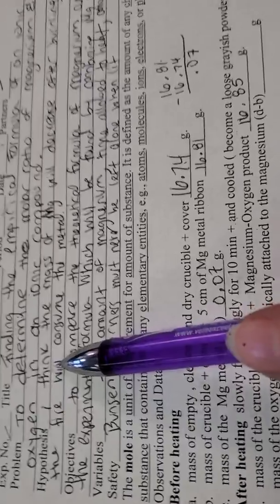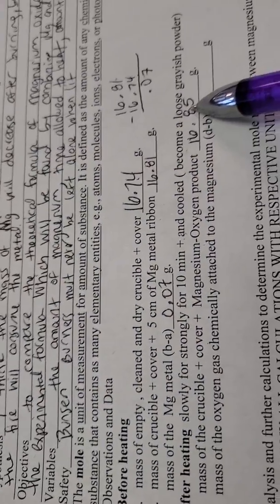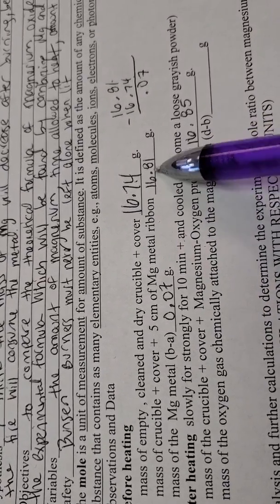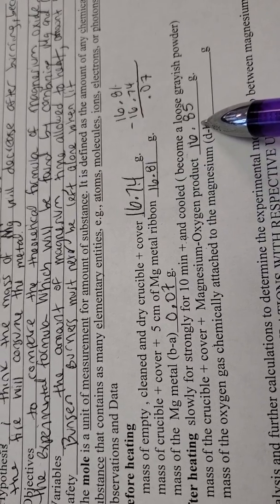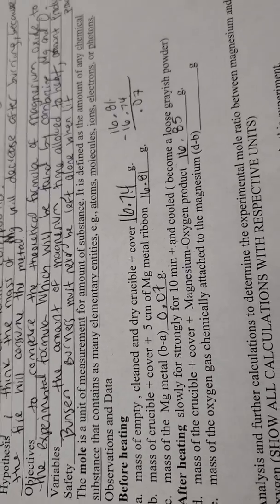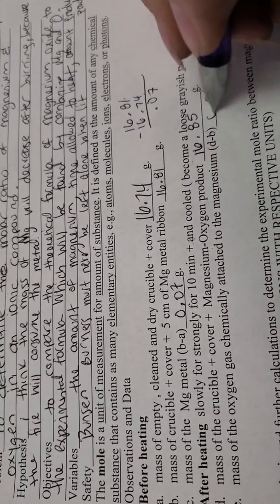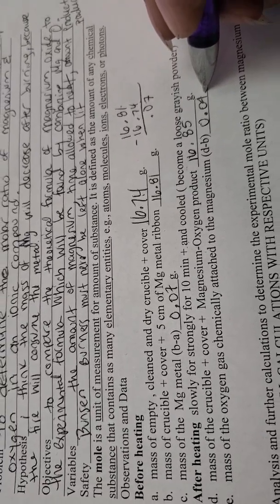Well, coming back to our hypothesis, do you guys remember we asked ourselves whether the mass was going to go up or down? Well, I said I thought the mass was going to decrease. But what really happened? The mass actually increased. See, here's the magnesium metal plus the crucible before heating, and here it is after heating. It actually increased by 0.04. So that 0.04, where did that come from? That was the mass of the oxygen that was added, right?